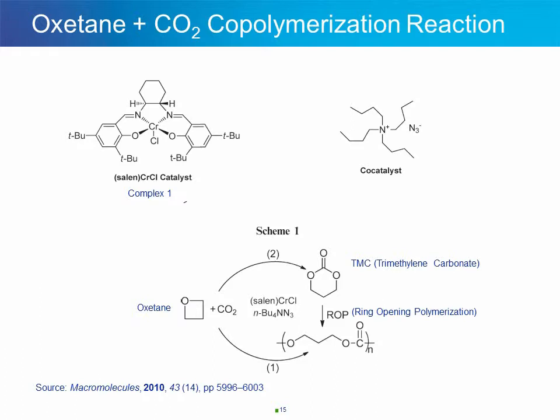They reported on this transformation as it pertains to the effects of a variety of cocatalysts on the selectivity of the oxetane and CO2 coupling reaction catalyzed by complex 1, again shown in the upper left. An investigation of the nature of the catalytic species involved in the reaction was described. Additionally, the dependence of reaction temperature on the selectivity of the coupling of oxetane and CO2, as monitored under high pressure by in situ infrared spectroscopy, was presented. Finally, the effects of temperature and pressure on the selective synthesis of TMC from the coupling of oxetane and CO2 were also discussed in this paper.